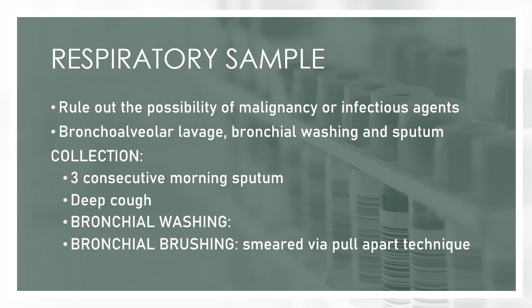For your sputum, it should be a deep cough again so that the sample is a true representative of sputum. If it is a true representative of sputum, then there should be a presence of alveolar macrophages. If there is no alveolar macrophage present in the sample, then the sample is just saliva.